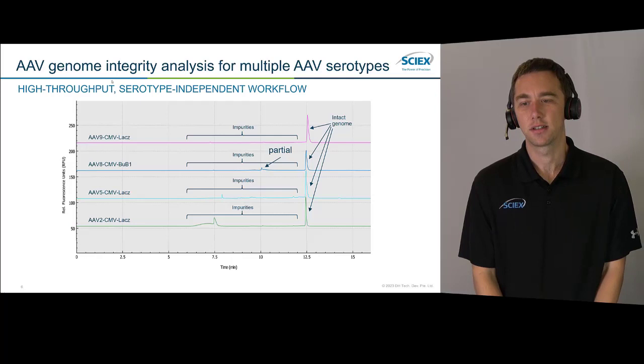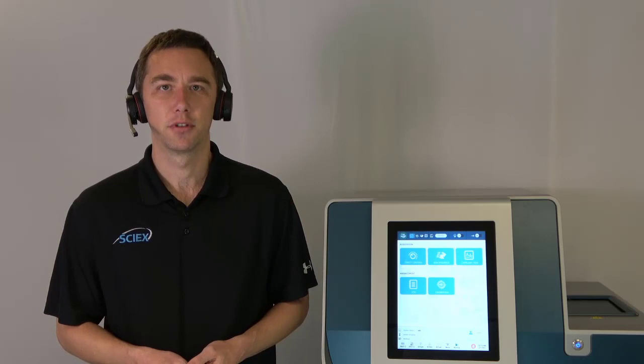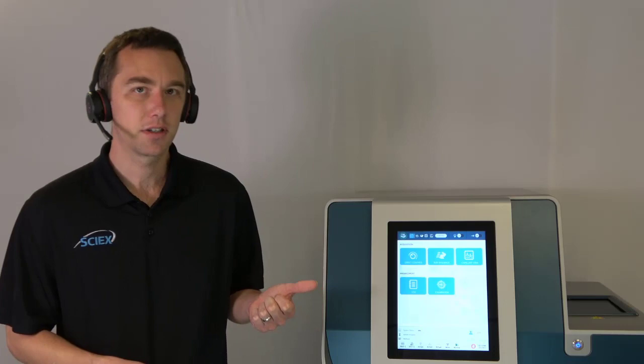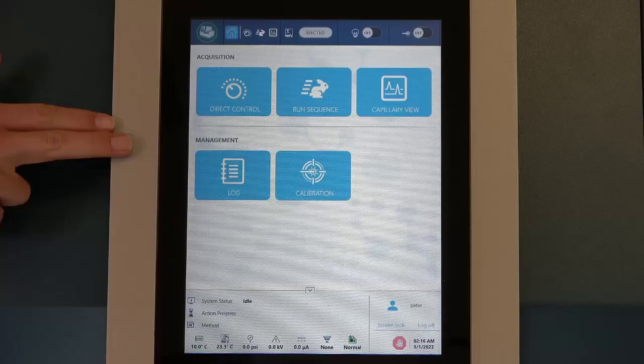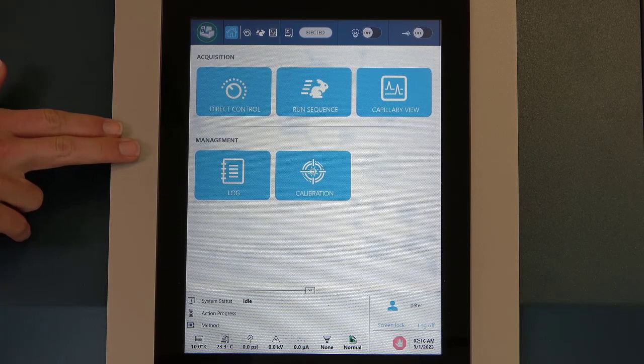Now let's go over the BioPhase 8800 system — a quick hardware overview of the system that's really going to enable this high throughput, high resolution workflow. Right here is our BioPhase 8800 system. One of the first things you're going to notice is this front panel — it's a touch panel — and on it we have different icons that we can press to directly control the instrument, run our sequence, or even view our run as it's going.